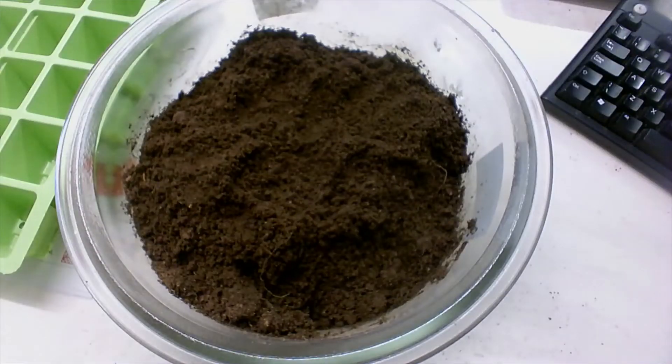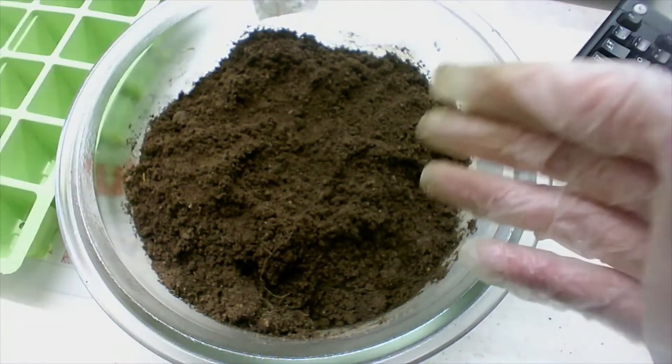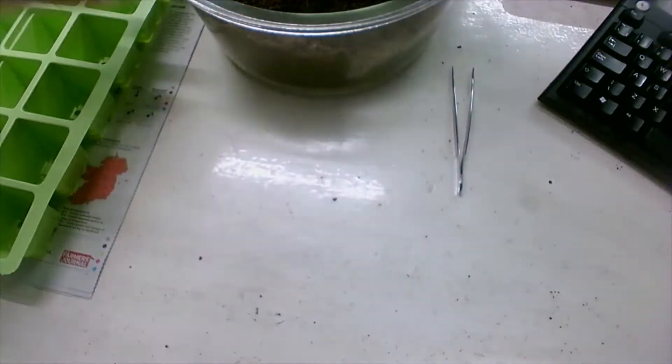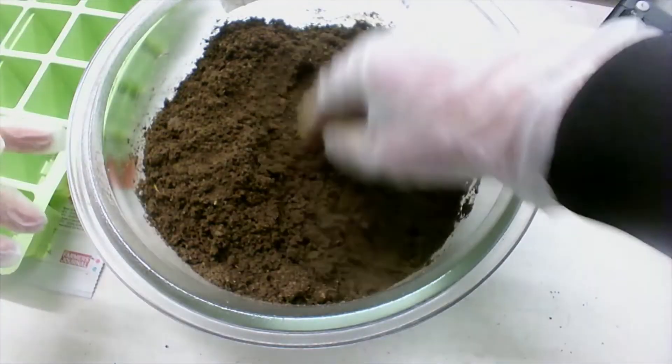So the first thing we have is our soil sample. It's sterile because I had it in the oven at 80 degrees Celsius for 30 minutes. I have to break up any large pieces of soil in this.